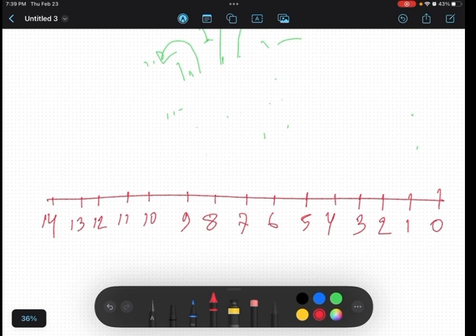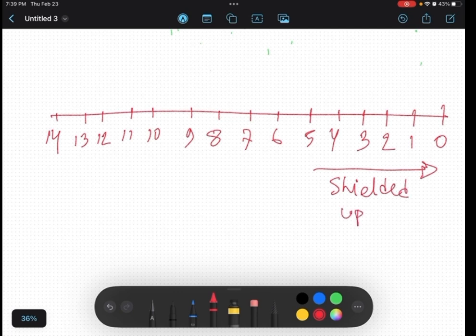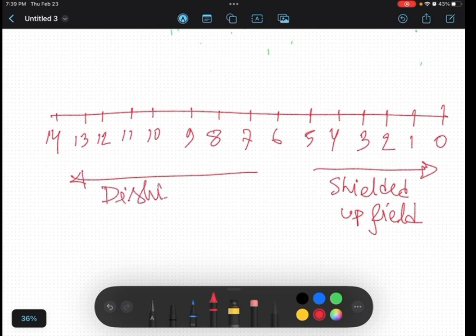Okay, so remember this is called upfield. As you go down to smaller ppm, that is upfield, shielded. If you write more shielded, it is called upfield. Remember that upfield is not an upper value. And if you go the other way, that is called de-shielded, downfield.